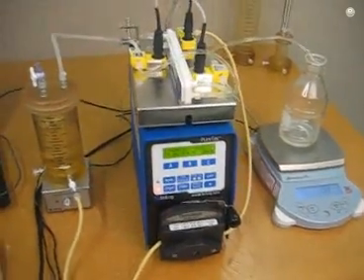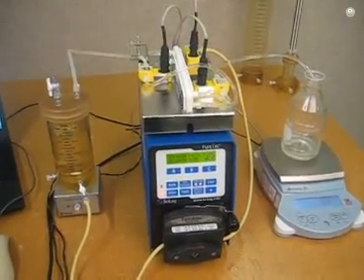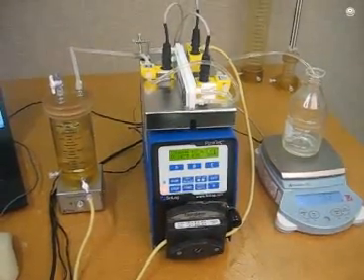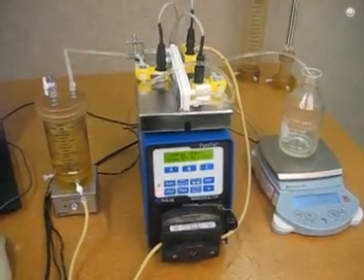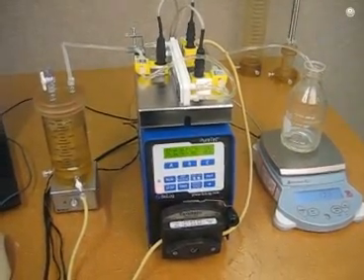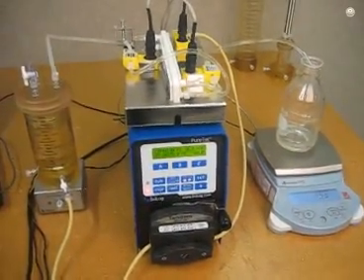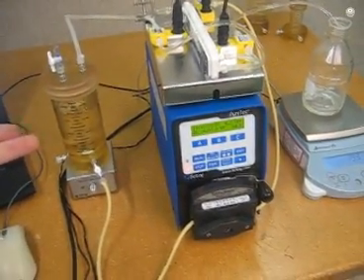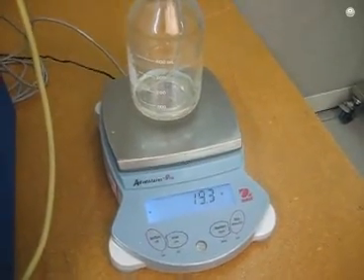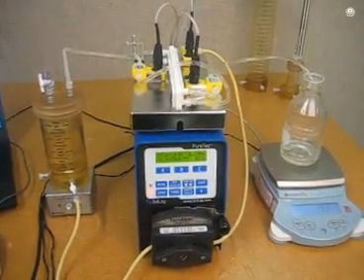Its maximum flow rate is about 2.2 liters per minute. What it can do over a manual system is automatically adjust the TMP in constant pressure mode, or it'll automatically adjust the flow rate if you want to do constant flow rate. That allows you to just set the system for, say, 16 psi of TMP and hit run and then walk away, because it's got a scale and it knows when it reaches a certain concentration. So if there's 500 milliliters in the vessel and you want a concentration factor of 2, we know that when there's 250 grams on the scale that your concentration is complete. That's how the system saves you a lot of time over the manual system.